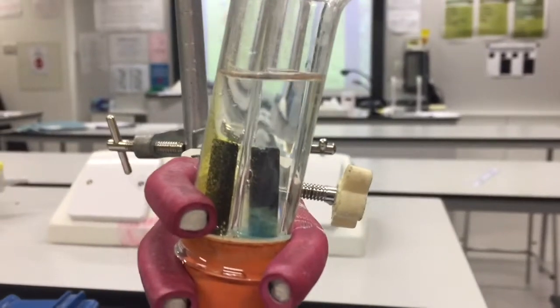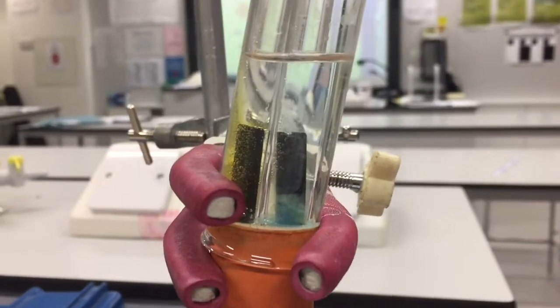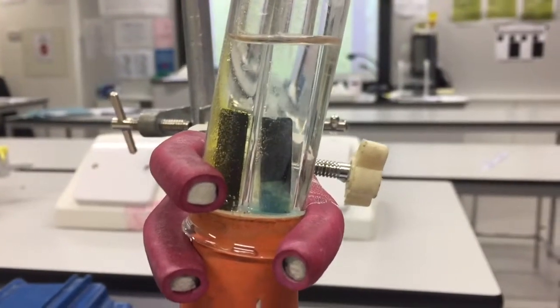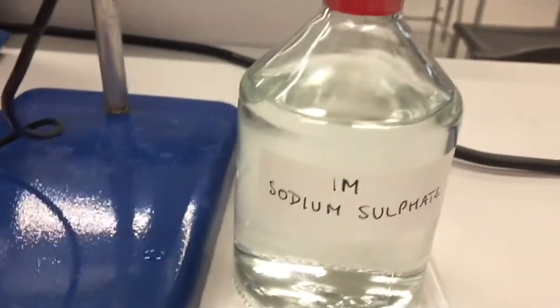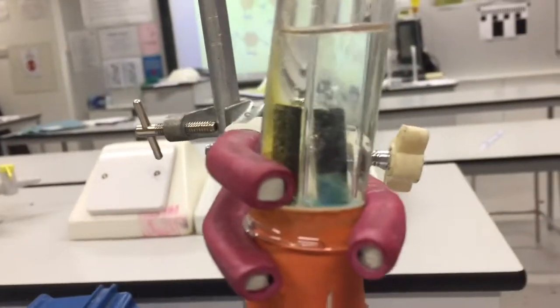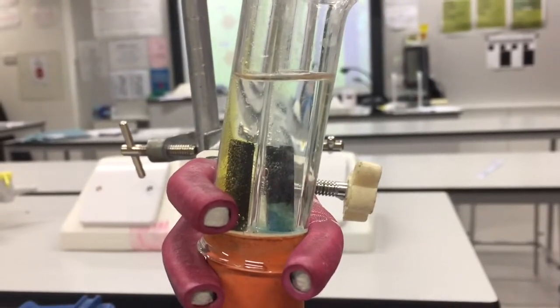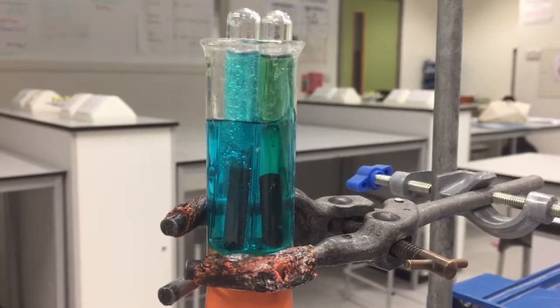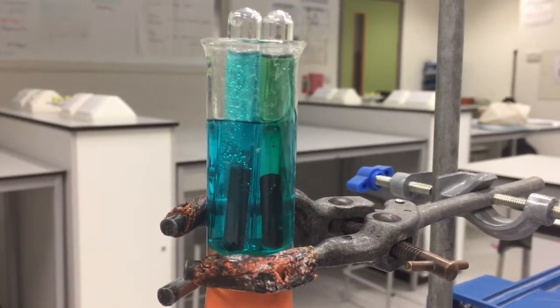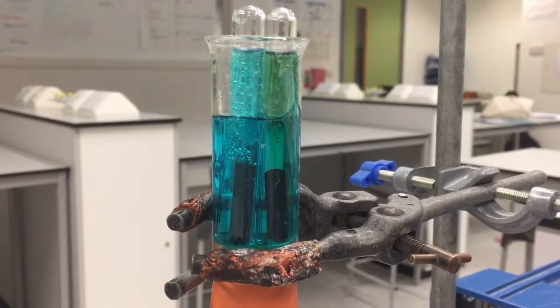We're also getting a gas produced at the cathode, and the cathode is going to again be hydrogen gas because sodium is more reactive than hydrogen, so the hydrogen gets produced instead. So the other question to ask is actually what's going on at each electrode. So we've got this process called discharging.